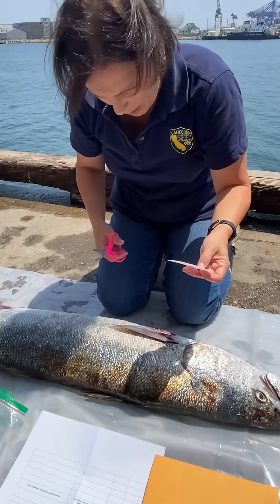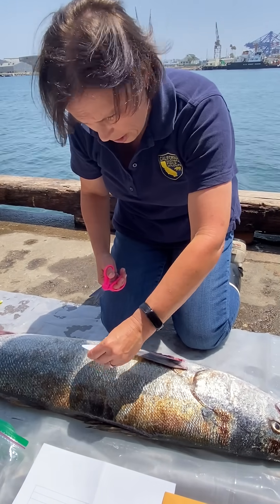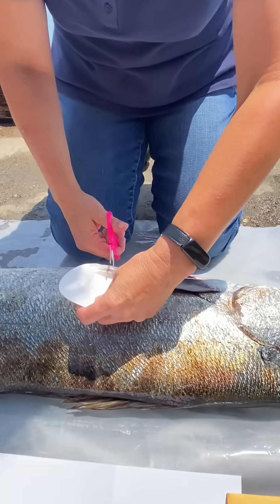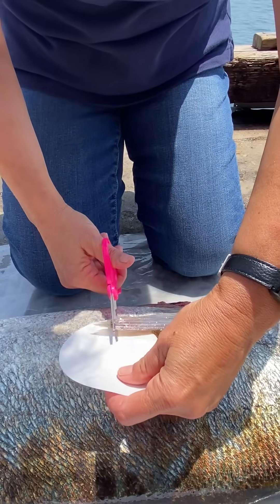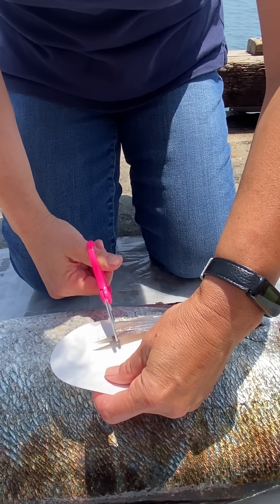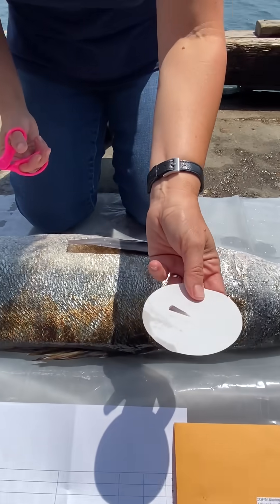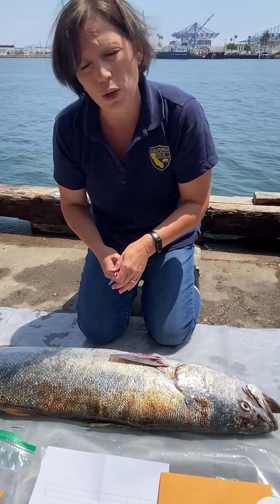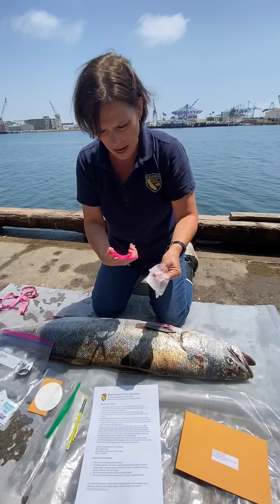Just grab a piece of the filter paper. What I like to do is put it underneath the white sea bass fin, and then all you do is cut a little piece off the fin. Set it aside in a safe area and let it dry out a little bit before you put it in the envelope, and then clean your scissors.